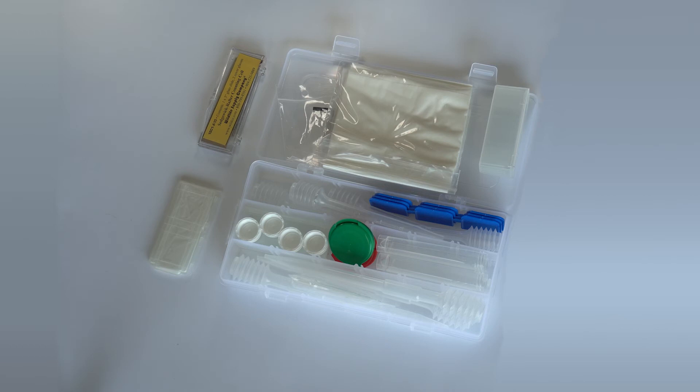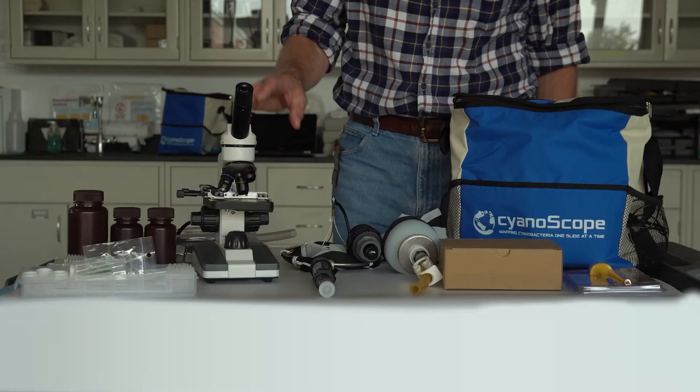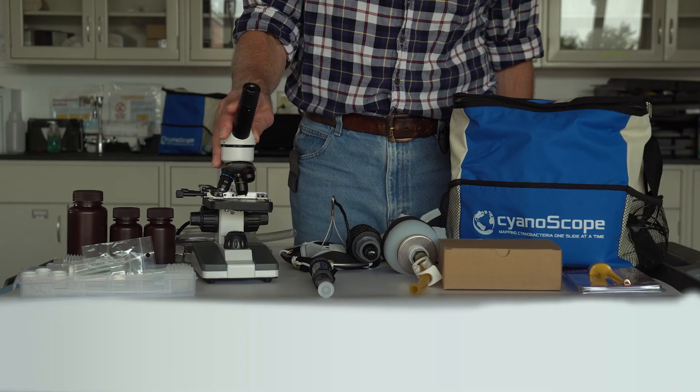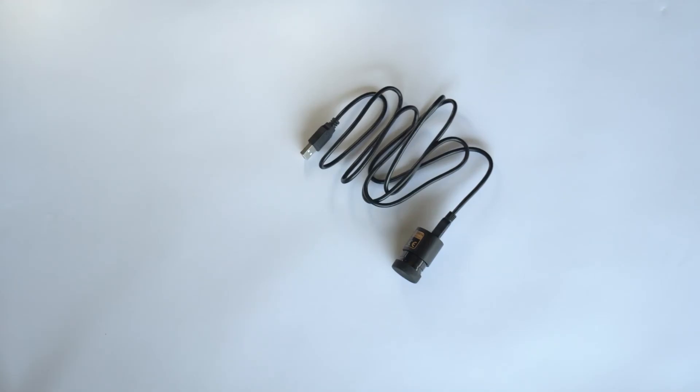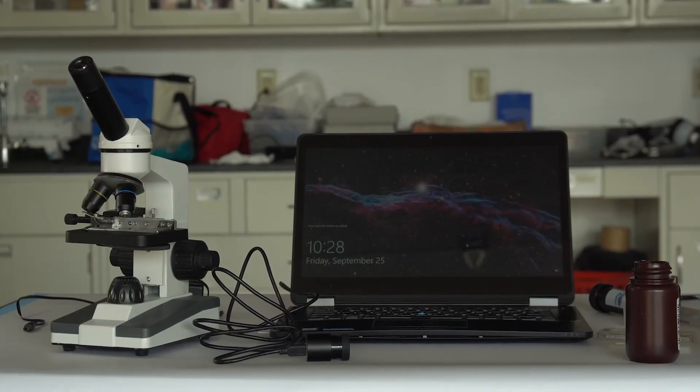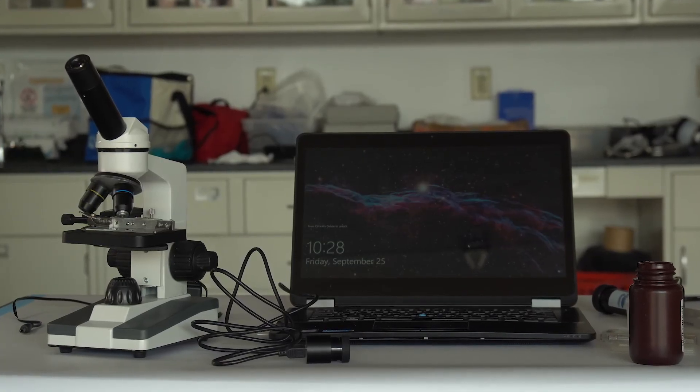Also in the collection kit are microscope slides, cover slips, and wipes. The cyanoscope kit also comes with a student-grade microscope and a digital capture kit that will allow you to upload your cyanobacteria images and data to the BloomWatch app.